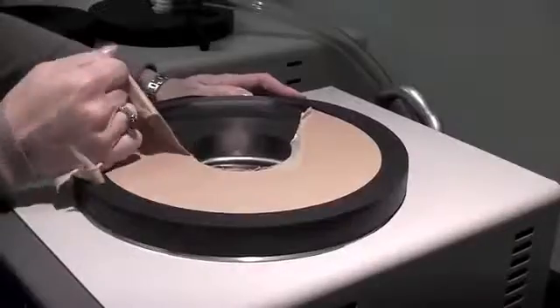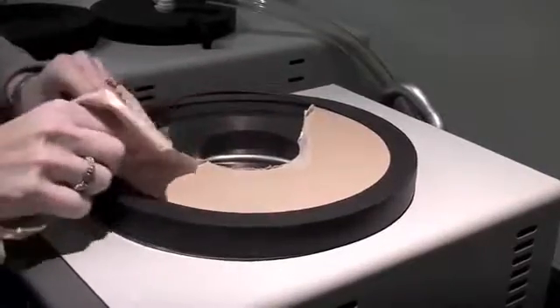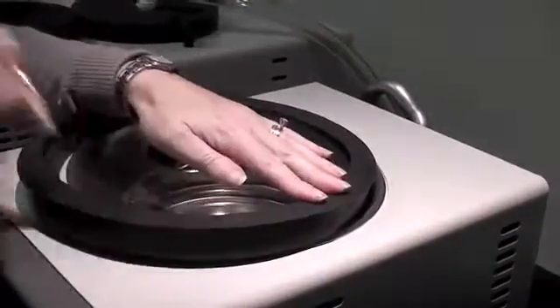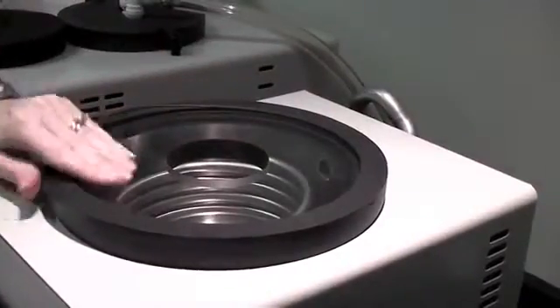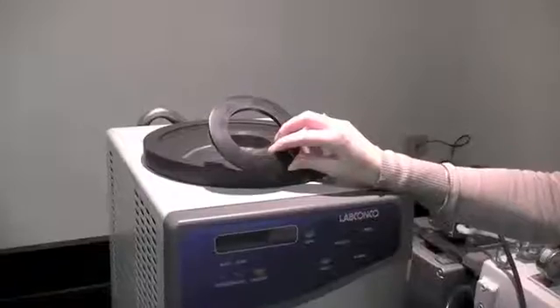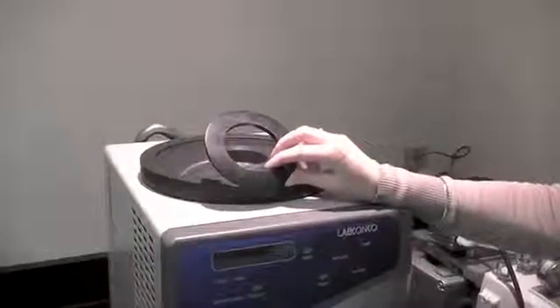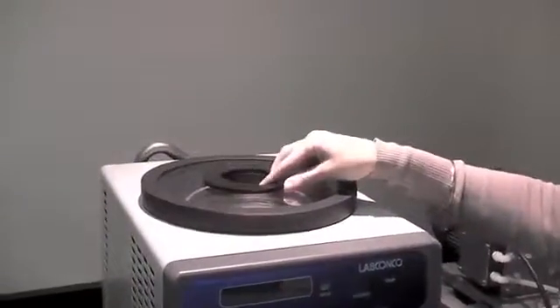Peel off the protective paper backing from the freeze-dryer's chamber lid and place the lid on top of the chamber. Center the flat rubber gasket on the hole in the center of the chamber lid.